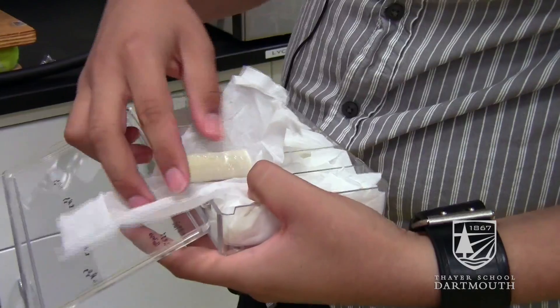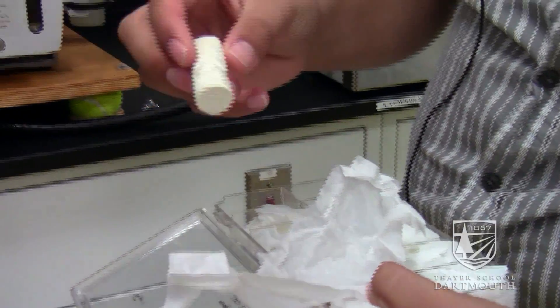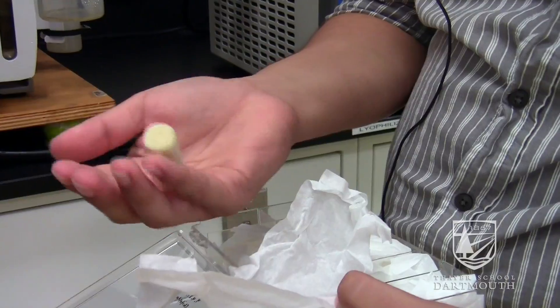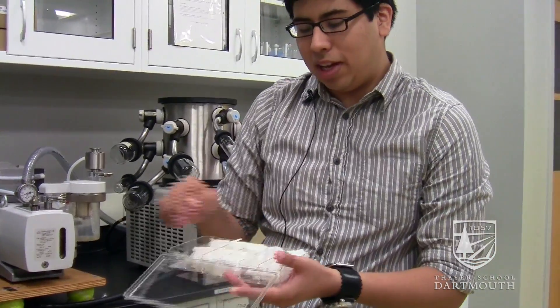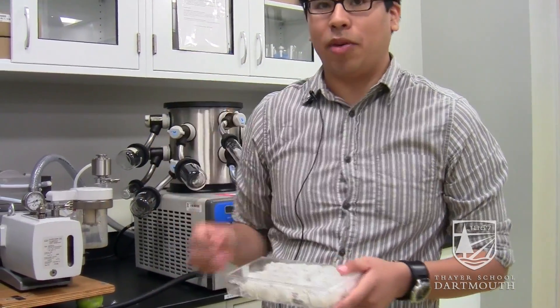Inside the sample, there are very specific microstructures that you can see repeatedly. The aim of my project is to explain why, and hopefully show that it's because of the mechanical influences of the mold we freeze in.